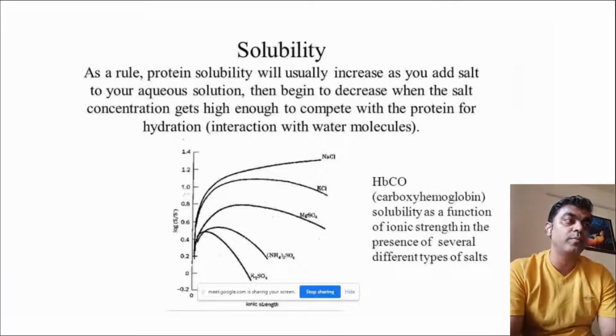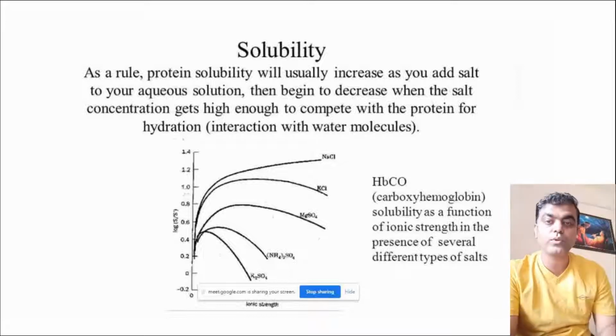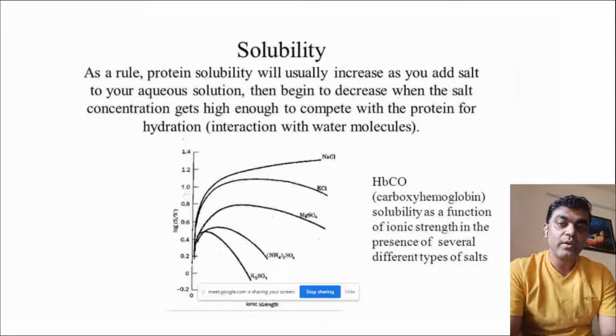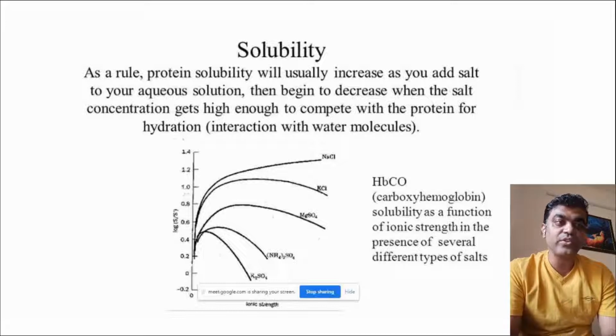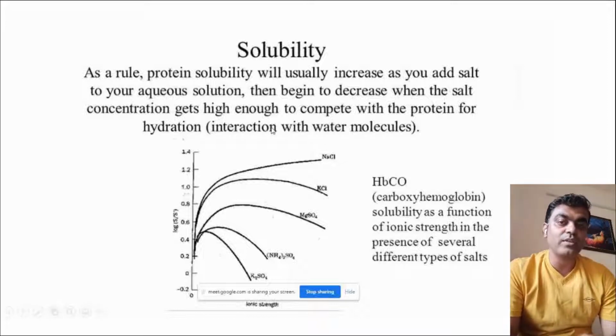The first parameter is solubility. Now solubility we know: as and when we have taken a solvent to which some solute or some salt is being added, initially when you keep adding, it will not get saturated, because the concentration of what you are adding to your solvent is very low. So you can add more and more, and gradually if you keep on increasing the salt in this solvent, the capacity of dissolving this salt gradually decreases, right?